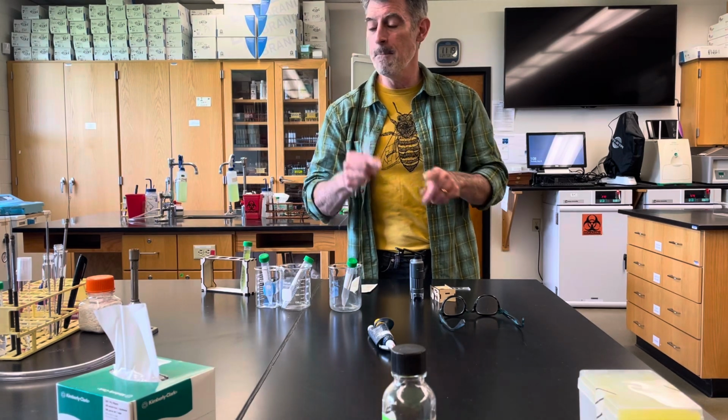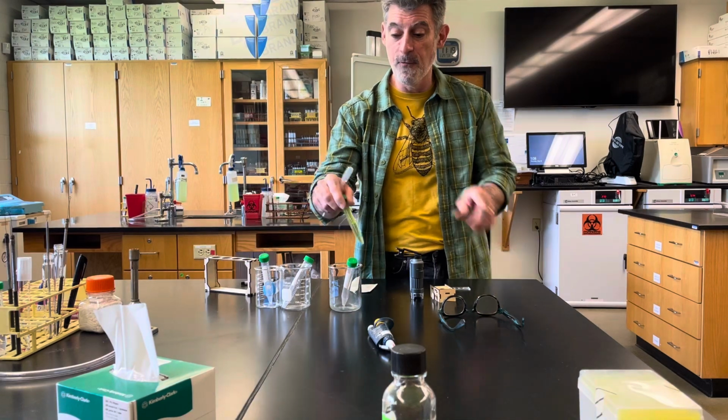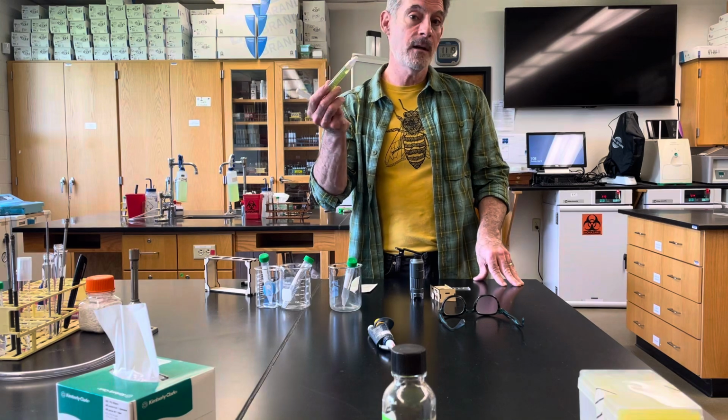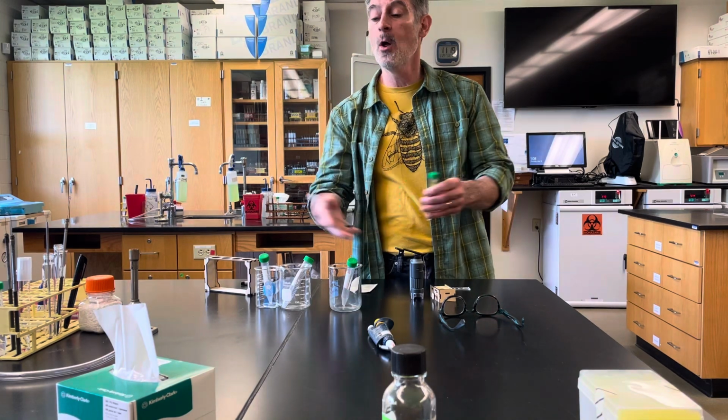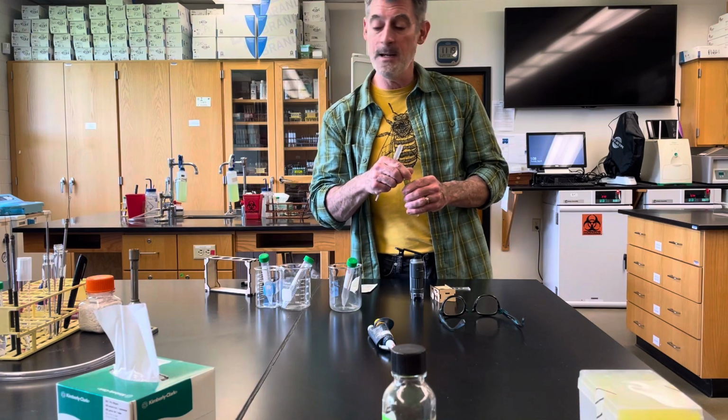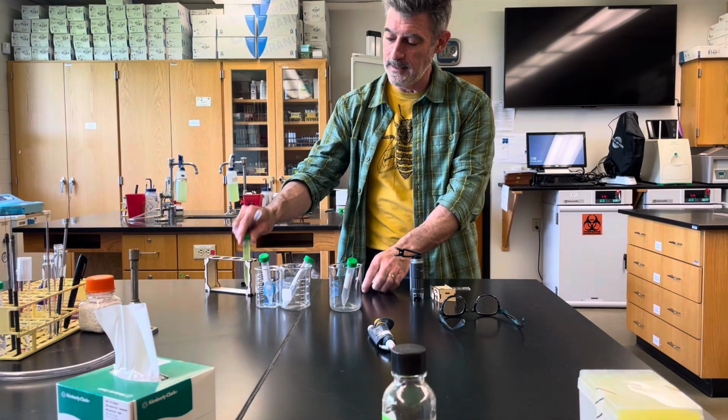But keep this in mind, before you begin the experiment, before you put it in the tubes, you need to have a concentration. So technically they'll all be the same when you start off. So you're going to take a little bit of this, put it in there, and then you're going to read a sample. So what I'm going to do is show you that little part.